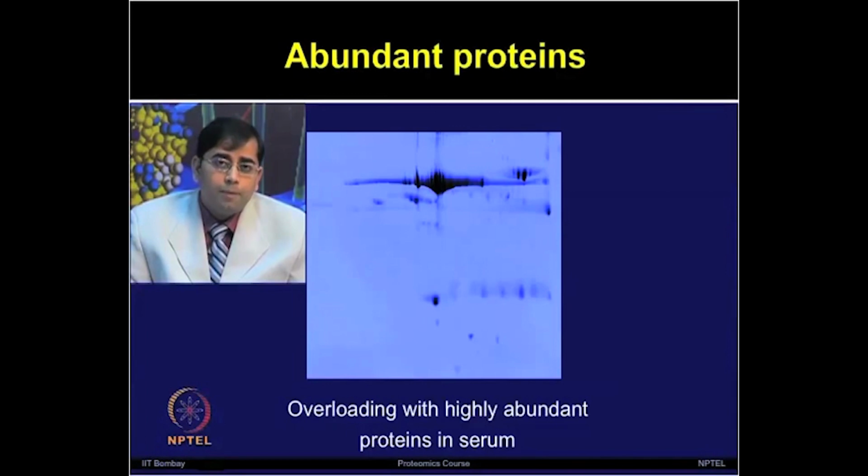In plants, one can expect RuBisCO as one of the very large proteins present in the plant leaves. These abundant proteins mask many smaller proteins and create problems in two dimensional electrophoresis, because of the IEF process, and when you stain the gel you can see different types of streaking, as well as the whole region being masked because of the abundance of that protein.